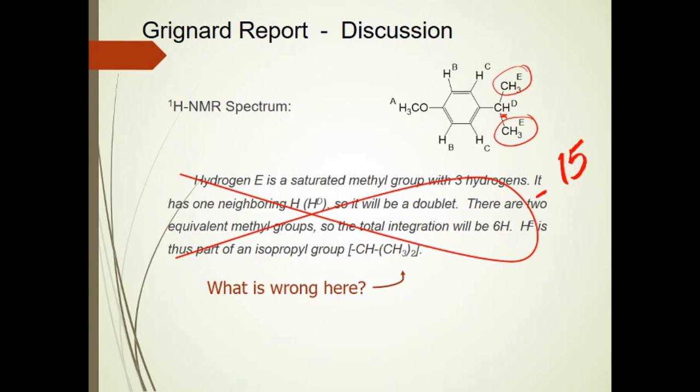And I see this on a regular basis. I've had a student in the past who accidentally opened his butyl benzoate spectrum, the one that was used for the NMR assignment, instead of the Wittig spectrum, and started trying to make his spectrum fit the product that he had.